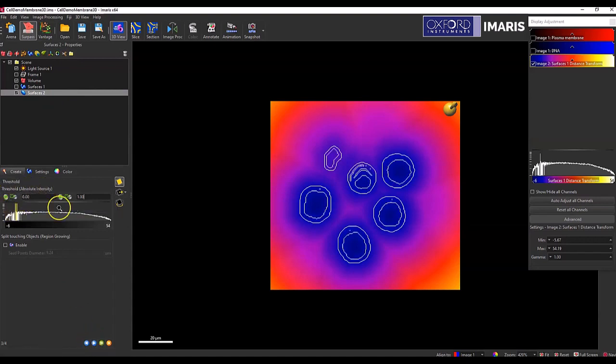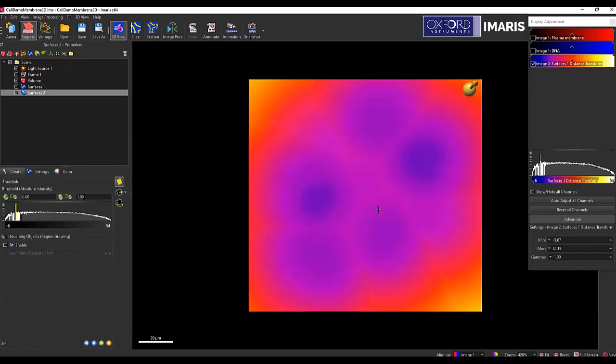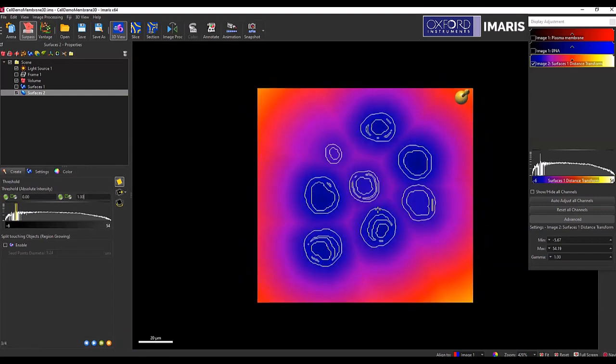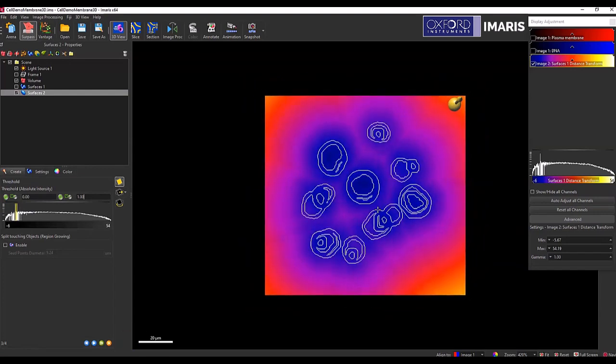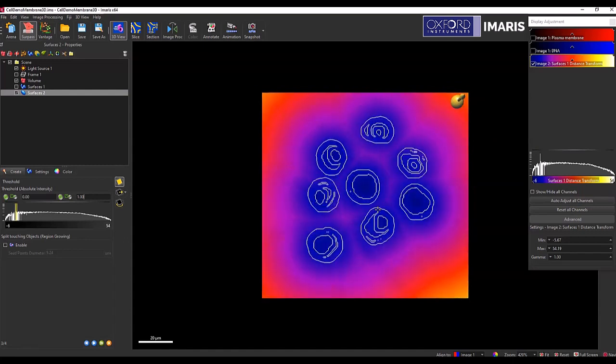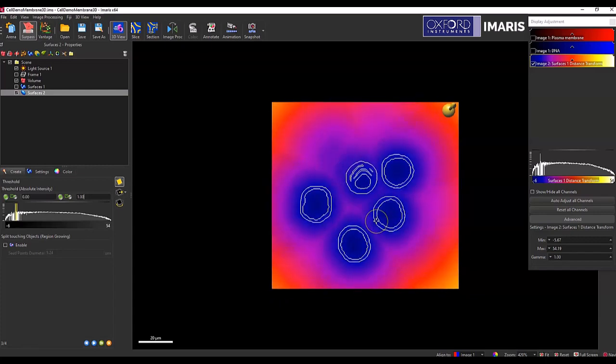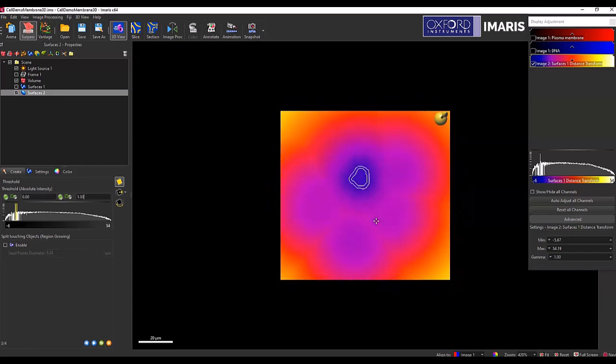Otherwise, I can just select it to be zero if I only want it to go in that perimeter around it. And so as we move through Z, you can see that it looks like maybe these two are touching each other, the surfaces there.